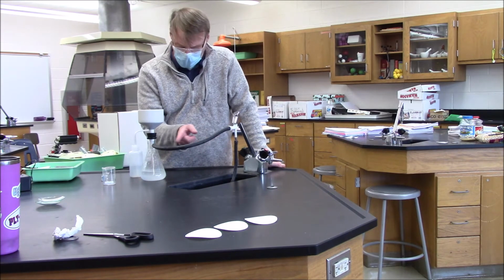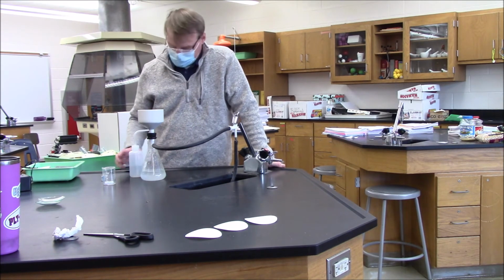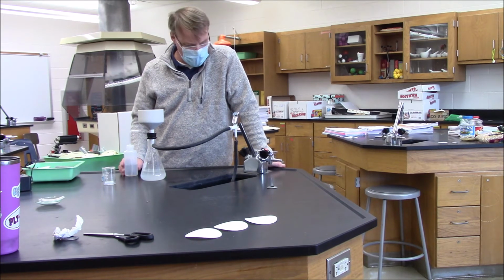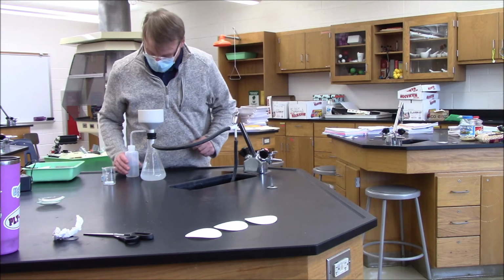So is this just creating a vacuum? Is that what it's doing? It is. So it's Bernoulli's principle. It's the same thing that works for a hose end sprayer. The fast-moving water creates a vacuum. I think that's how we used to empty a swimming pool. Yeah, it's true.